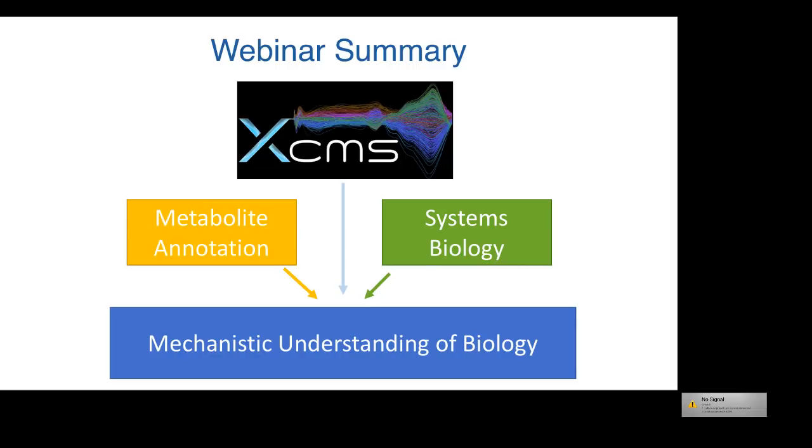In the systems biology portal, we should stress that the metabolite lists on the pathways are putative identifications, and that you need to go back in and do formal identification processes on the metabolites that you think are very important to your study.